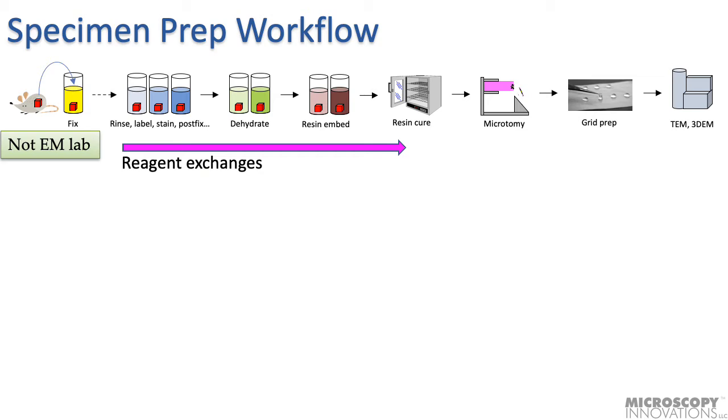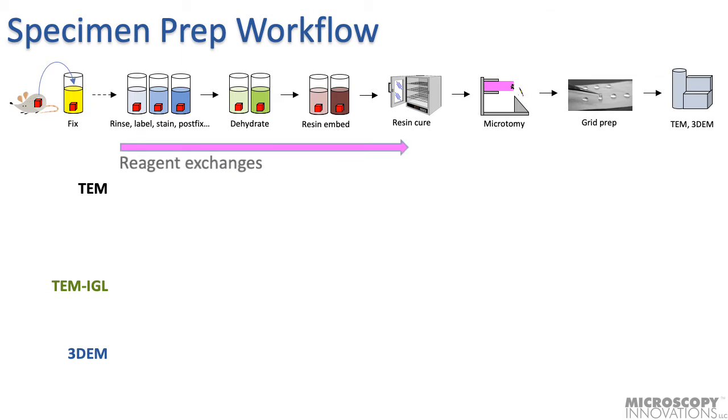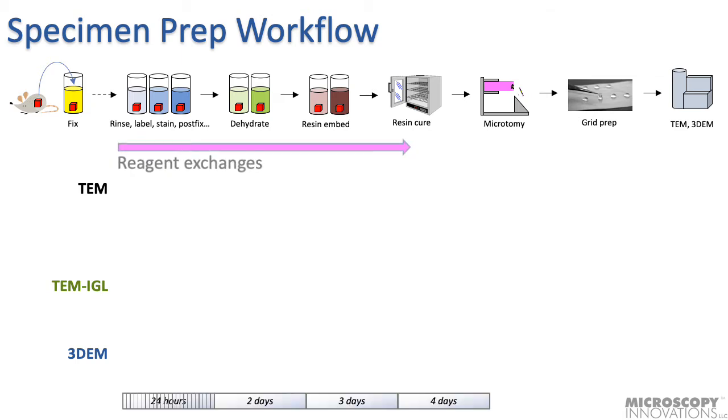Again, I will concentrate on the reagent exchange workflow for three applications: transmission EM, immunolabeling, and 3D EM. I will quantify the preparation timing and hands-on effort that begins with a specimen initially fixed in aldehyde to the beginning of resin curing. And we'll be able to quantify this over time and effort.